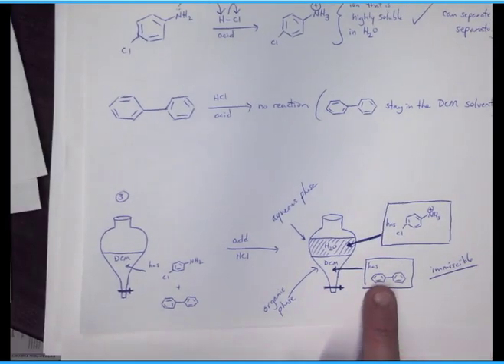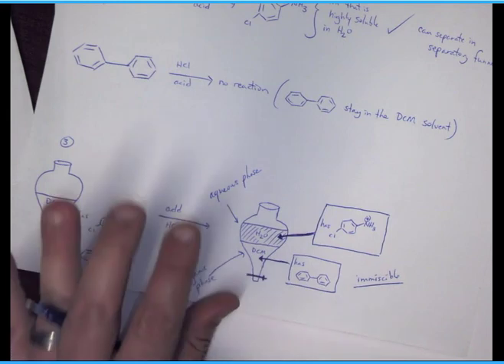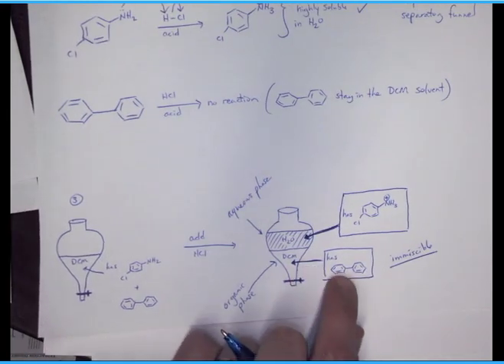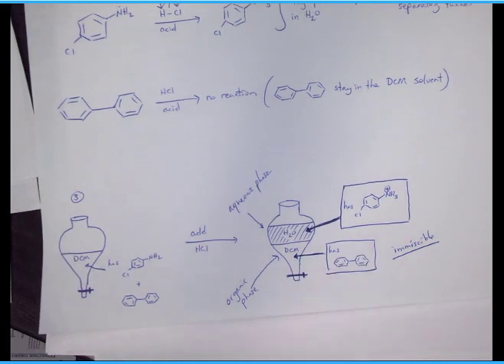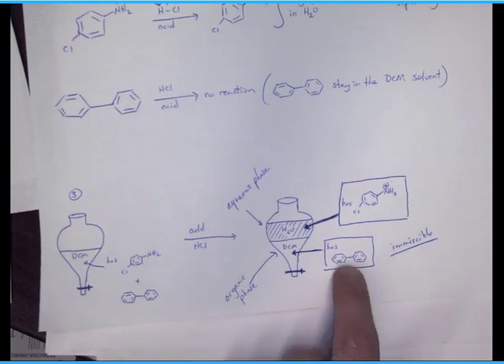Now, in your final step of your separation, when you just have your biphenyl left in the DCM, this won't react with an acid or a base, and so the way you're going to remove that is you're going to use the rotovap. This allows you to remove the solvent, remove the DCM, based off of its volatility. It's going to remove the DCM, and you're just going to have a solid powder of your neutral compound left over in the rotovap.